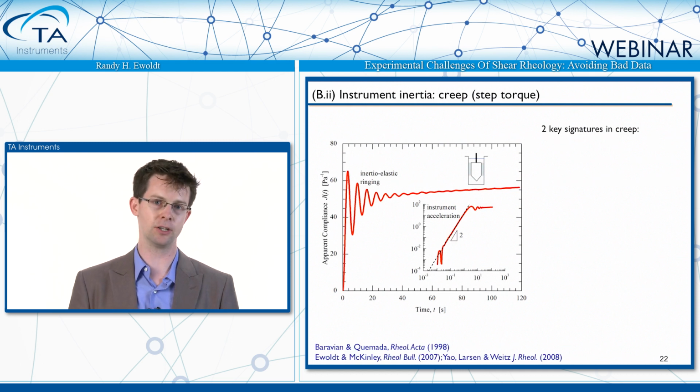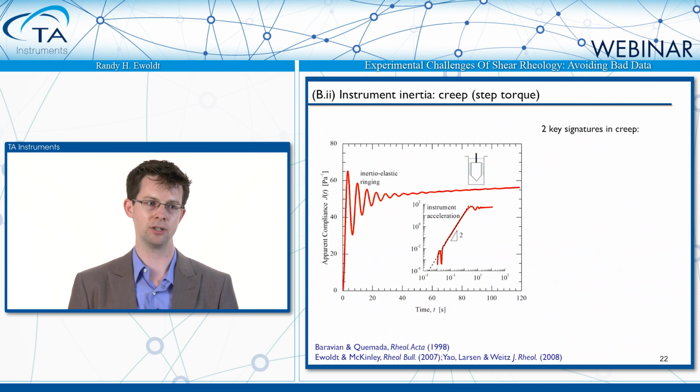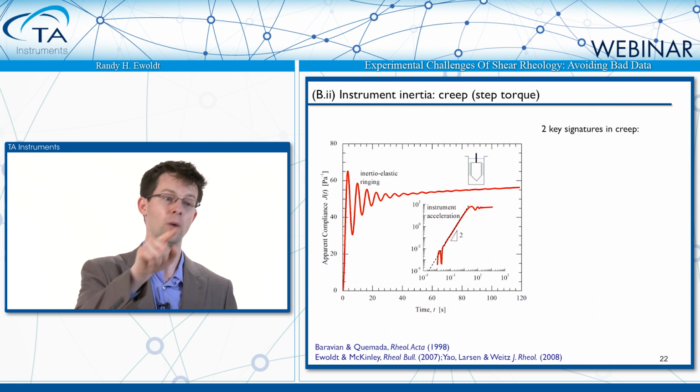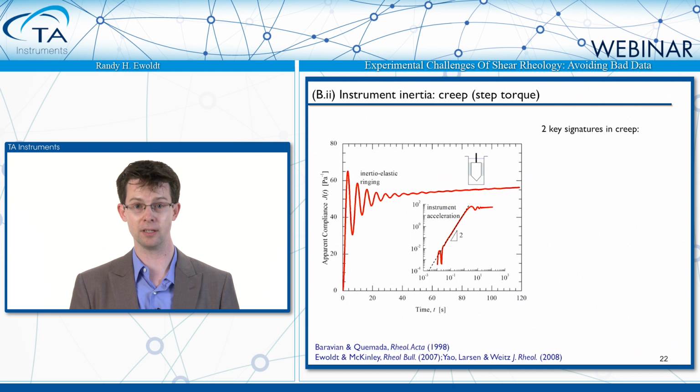And you see these oscillations. So I'm not asking for an oscillation, but it's giving me an oscillation. Moreover, if I look at short time scales with that inset, what I see is it looks like there's a very distinct power law region where it looks like my displacement is growing by time raised to the power 2, which is a quadratic increase in time.